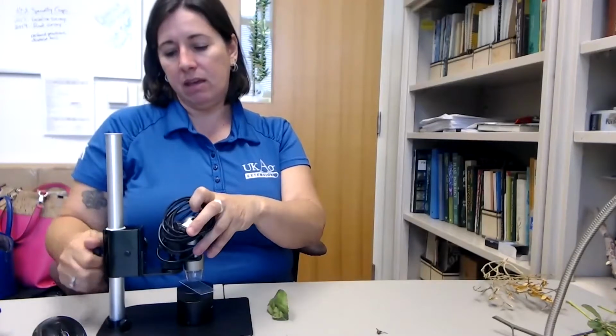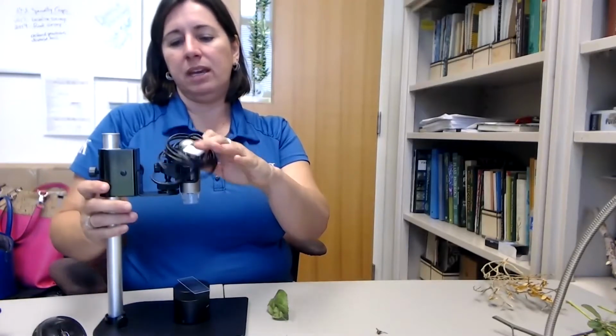And then there's your compound scope, with the screen being your viewfinder, okay? Questions there?